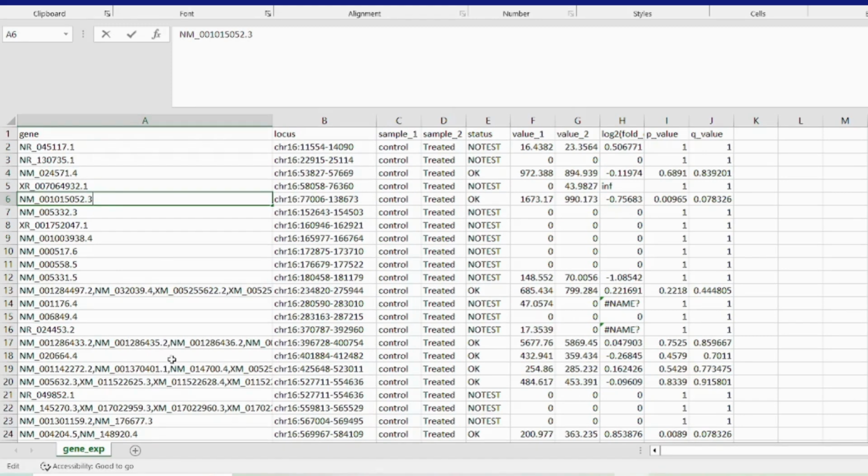So this is how you can do it, but manually it is not possible, I can understand. So you can take the help of some Excel formulas or some programming language for it. But as of now, in our case, all the IDs are the same, so we have to discard them. And how to discard them?